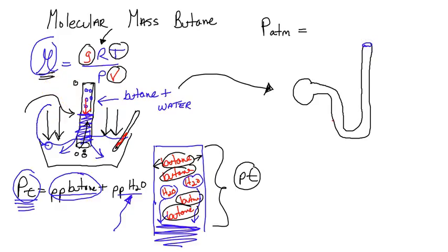So this pressure of the atmosphere, we'll make that a black arrow, is pushing down. We have liquid, which is water, and we have liquid in the manometer. Obviously, that's really what we look at, comparatively speaking. And then we're going to have the pressure, the PT, the final pressure inside the container. We're going to put that right here. So PT is right there. Let's put the liquid. Now, who's winning? Clearly, atmospheric pressure is pushing the liquid back and pushing this back. So I would draw it like this.